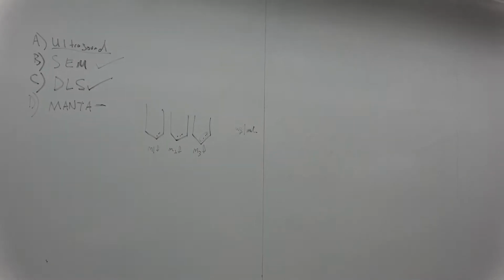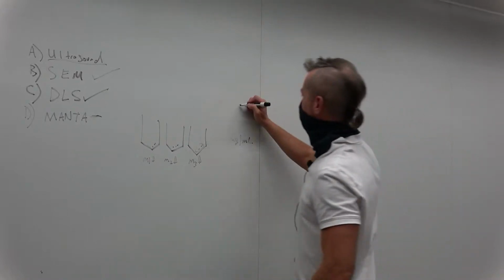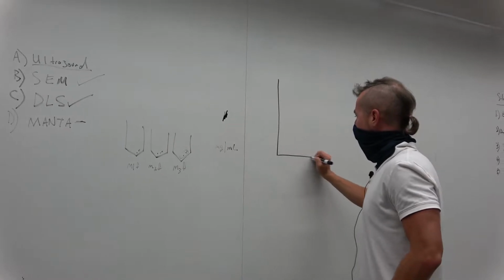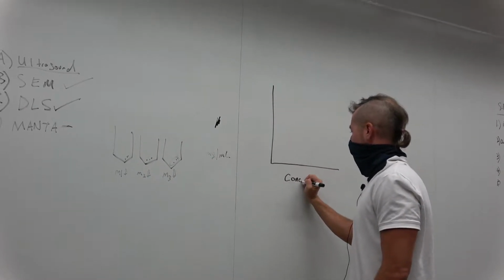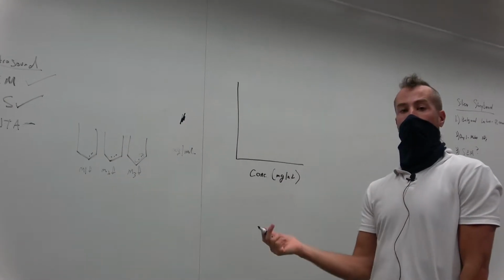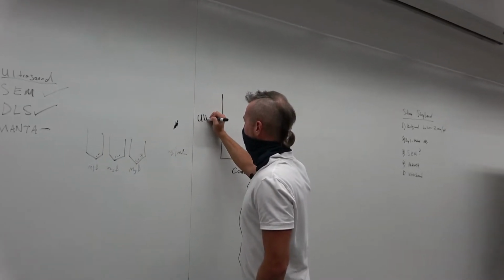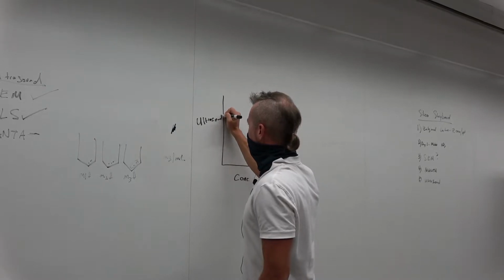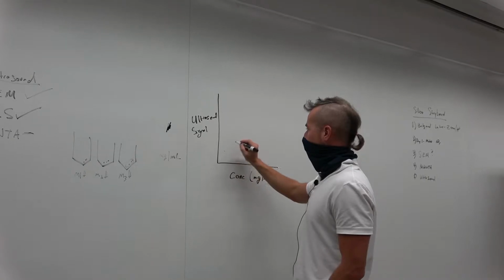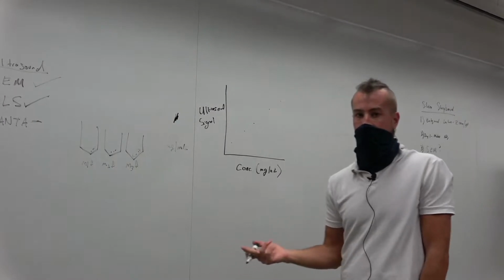Okay, great. So now that we have this concentration in milligrams per mil, the ultimate goal here is to measure how does the ultrasound signal change as a function of concentration. And hopefully, more concentration equals more signal, right? We should see that.